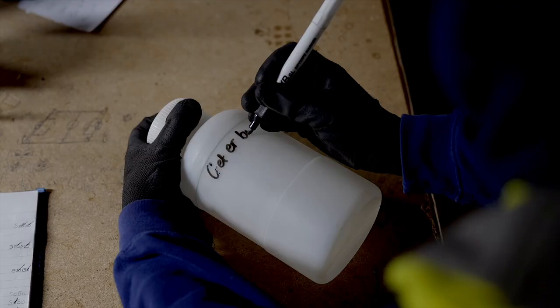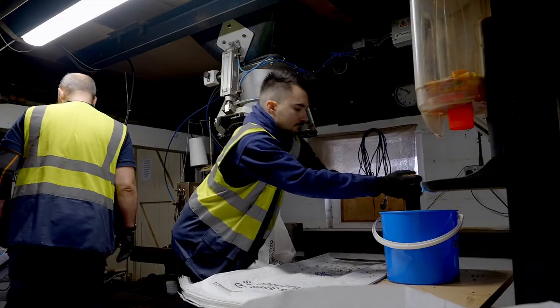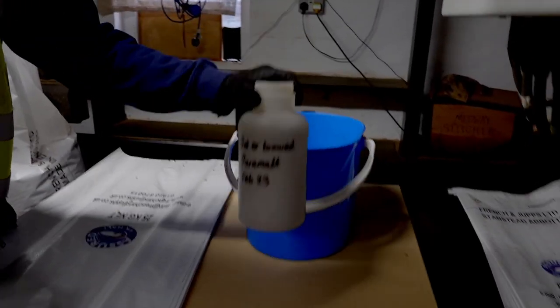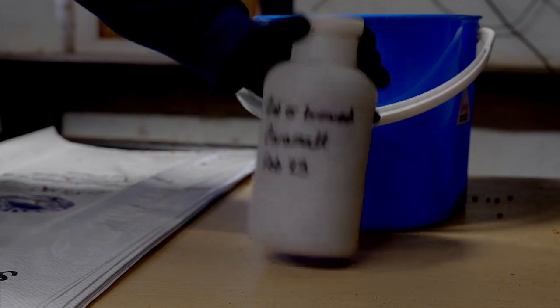So we watched the guys earlier at the packaging line — they were taking a little pinch out of each bag, and that comes over here for the certificate of analysis to be generated. The tests are quite simple because it is speciality roasted malts or coloured malts — we don't have to do a lot of tests that you would have to do with white malts or distilling malts. So basically it's colour — that's the most important thing. We test for moisture and we test for extract, both dry and as-is.